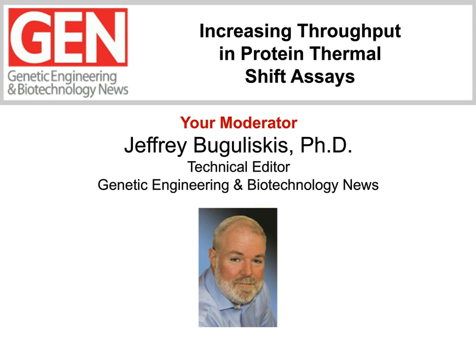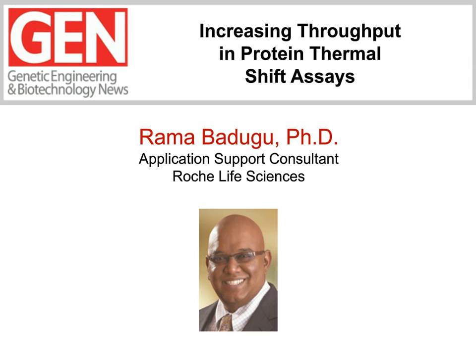Our speaker today, Rama Badugu, is an application support consultant at Roche Life Sciences and Roche Diagnostics. Dr. Badugu will highlight the specifics of the thermal shift assay and describe strategies for employing it as a high-throughput screening method while utilizing Roche's LightCycler 1536 real-time PCR system.